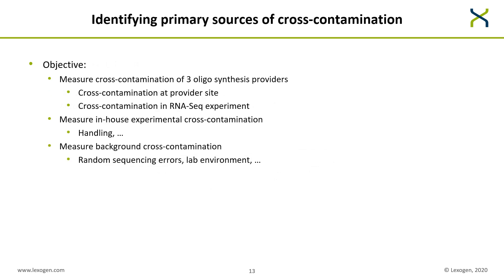With our dual index experiments we also wanted to look at primary sources of cross-contamination, measuring three different types. First, cross-contamination related to three different oligosynthesis providers, distinguishing between cross-contamination at the provider site and within an RNA-seq experiment. Second, in-house experimental cross-contamination, mainly the result of handling. And third, background cross-contamination resulting from random sequencing errors or the lab environment.